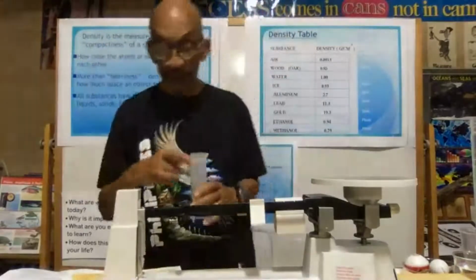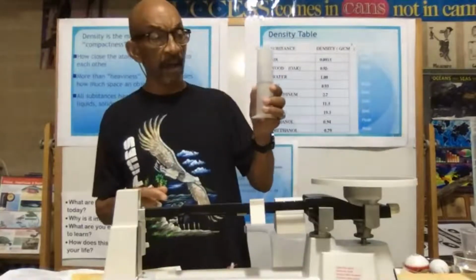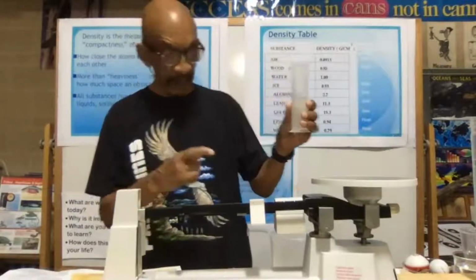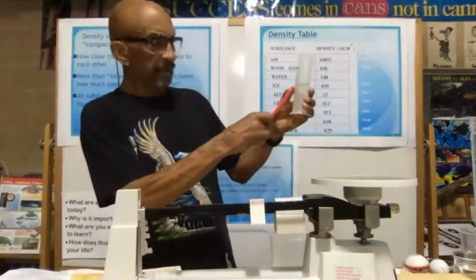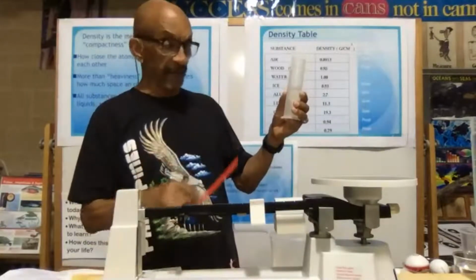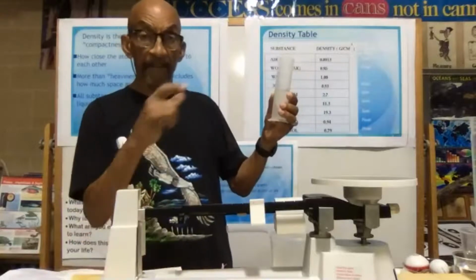To do this correctly, first of all, you have to get a set amount of water into your graduated cylinder, okay? In this case, I put it at 60 milliliters. Now, I didn't put the marble in yet, because I'm going to have to take another measurement after I put the marble in.